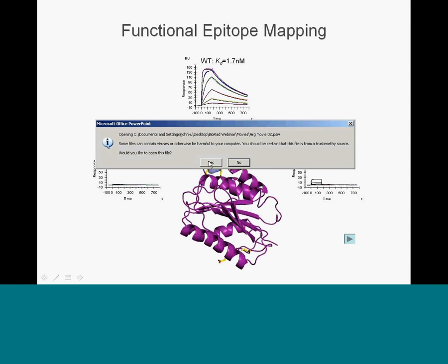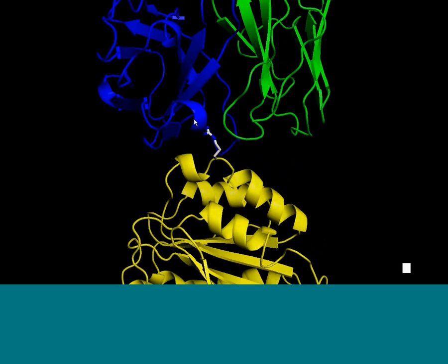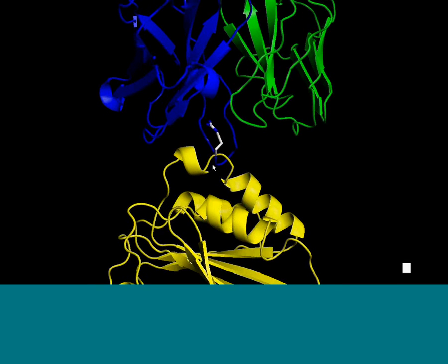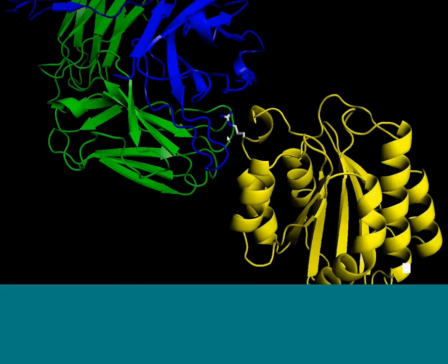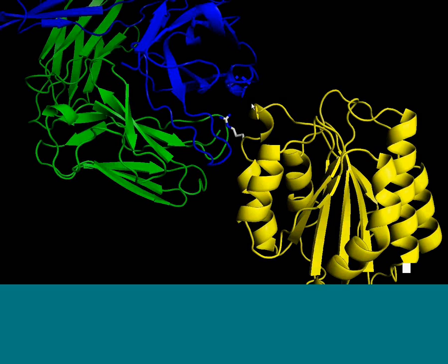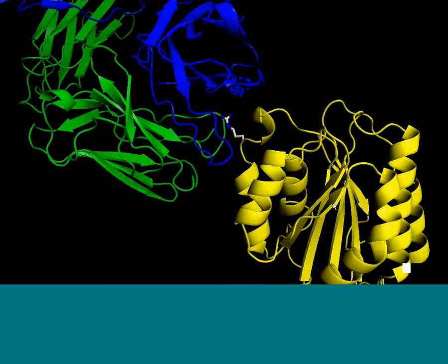But if we take a look, one of the things we notice is, if we can go in here and imagine that we don't have the antibody. Are you able to see my presentation right now? Yes. Okay, so the heavy chain here is in blue, and the light chain is in green, and this is one of those first arginine residues. We'll see that this is largely just sticking out into solvent. If we imagine these things aren't here, it's not making any contacts with, say, acidic residues in the ligand here. I mentioned in the acknowledgments the four different structures. This is also the case in the crystal structure of the free ligand.